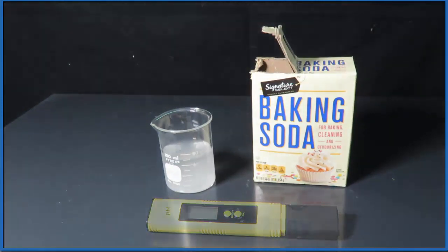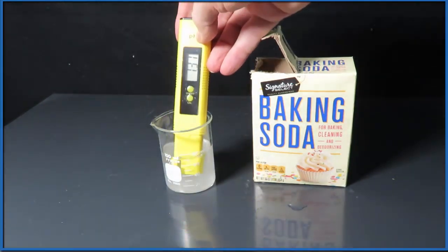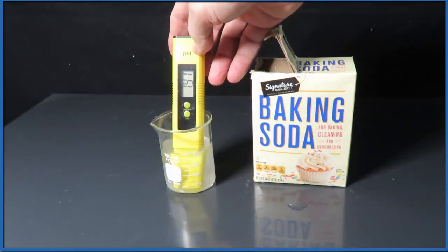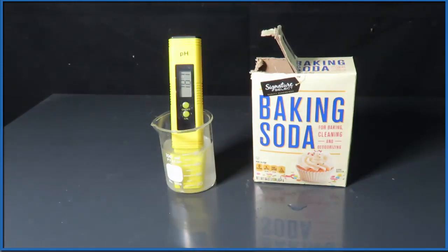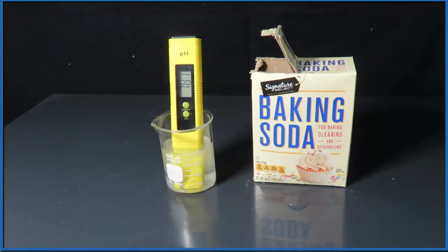So we put the pH meter in and it reads 7.89, 7.88. Let it equilibrate a little bit and the pH is right about what we expected, between 7 and 8, closer to 8. So the pH of baking soda according to our pH meter is right about 7.8.